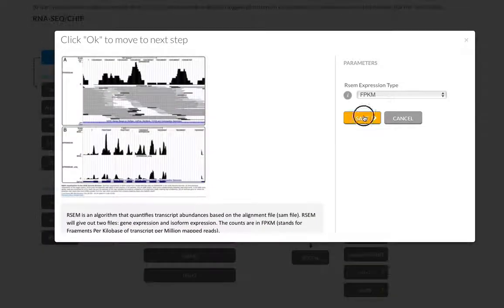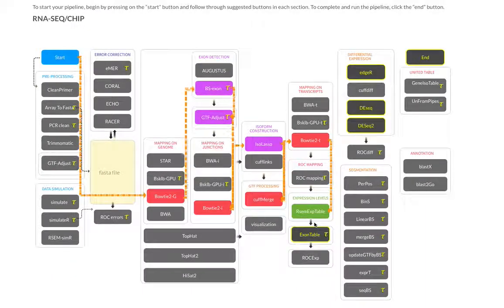And finally, RSEM expression table, and this is a more complex, expanded pipeline that uses my custom configuration to get a more detailed view at various elements, also those that are not known, and some of them putative genes that could be expressed. And again, I have the option to separately look at exons and separately do differential gene expression.